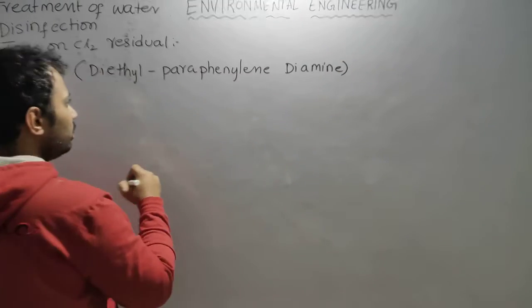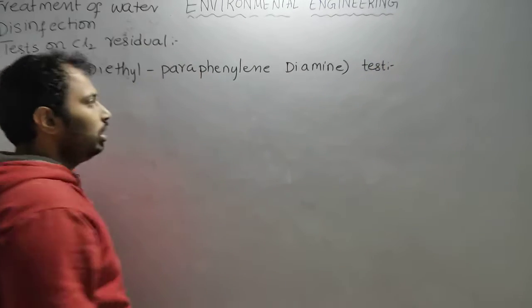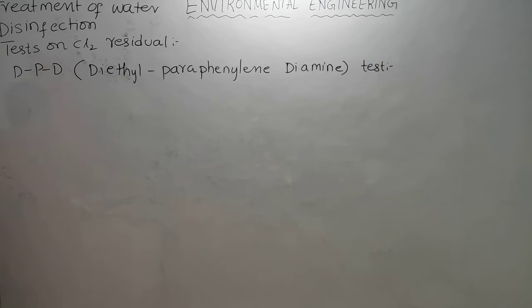In this test, it is also a color matching technique. Here the reagent is DPD.